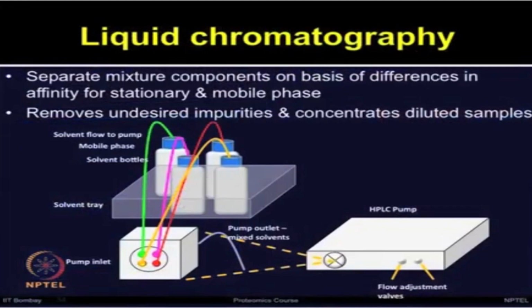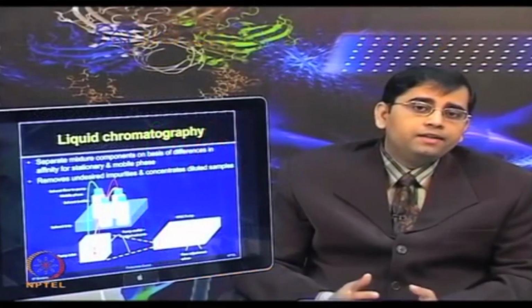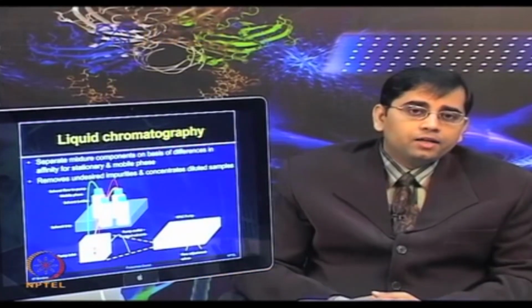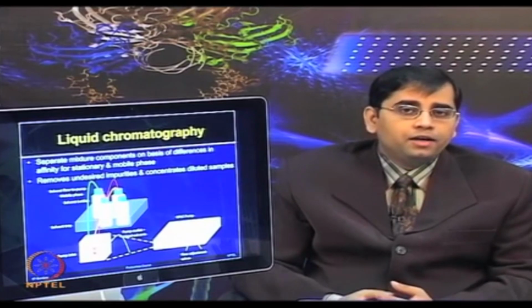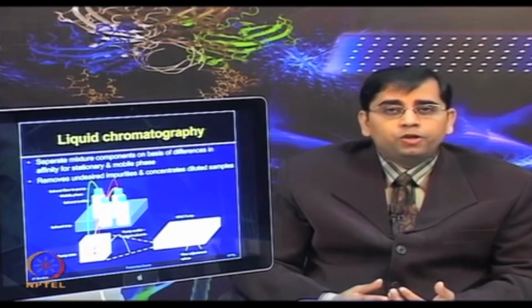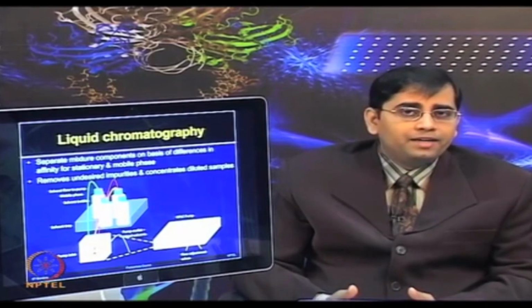Liquid chromatography separates mixture components on the basis of differences in their affinity for the stationary and mobile phases. It can remove undesired impurities. Therefore, for various types of mass spectrometry based applications, it increases the reproducibility and robustness of analysis of peptides and proteins.